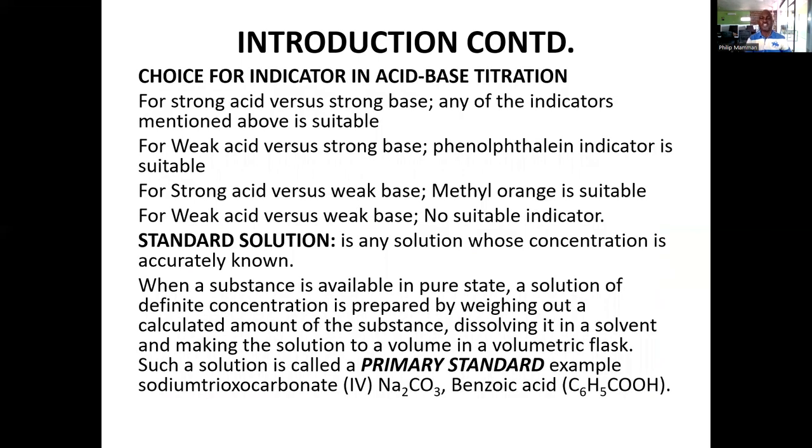Now, choice of indicator. How do we choose indicators for acid-base titration? The choice of indicator for acid-base titration is usually based on the strength of the acid and base. For a strong acid and strong base titration, any indicator mentioned above is suitable. But when you are titrating a weak acid versus a strong base, what's an example of a weak acid?